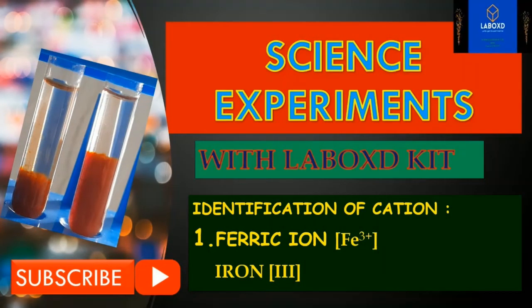Today's experiment is identification of cation. Ferric ion, Fe3+.